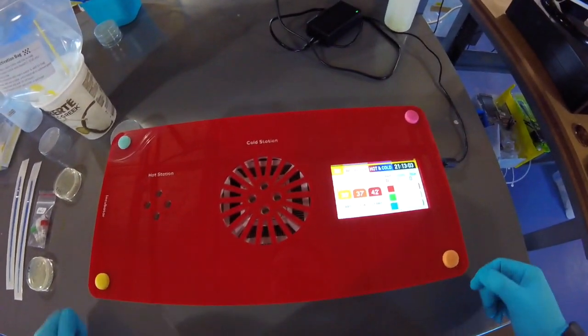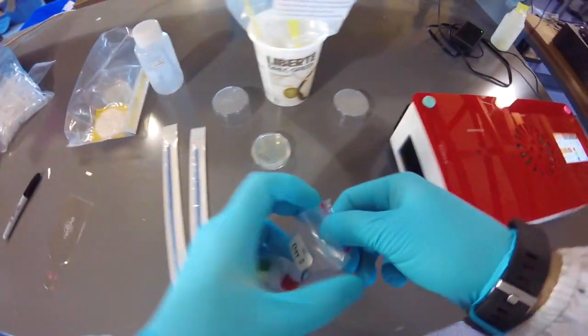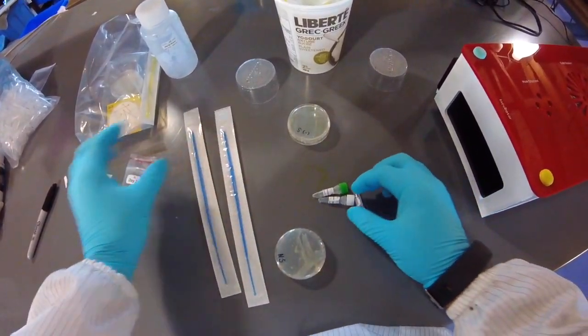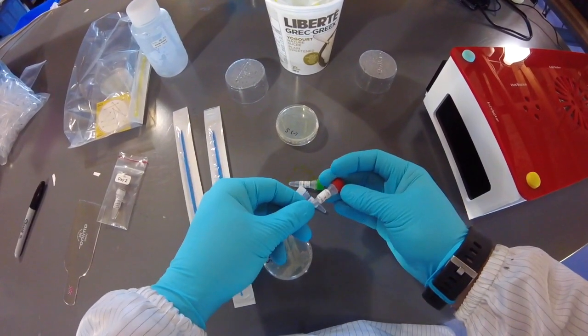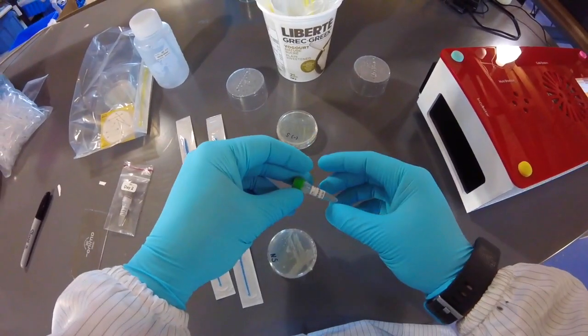All right, so for today's activity, we're not going to be using the plus cells, that's for tomorrow, but we are going to be using some DNA, a tube here called transformation buffer or T buffer, and this recovery media, all right?